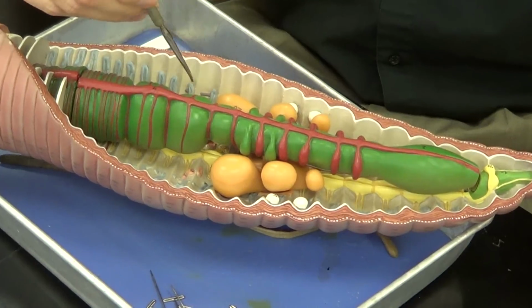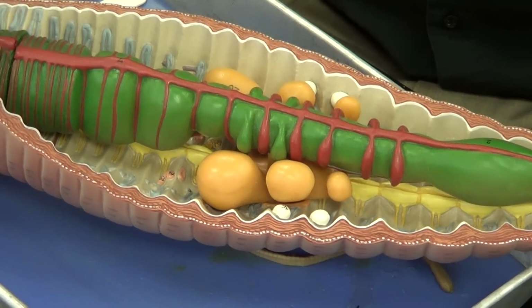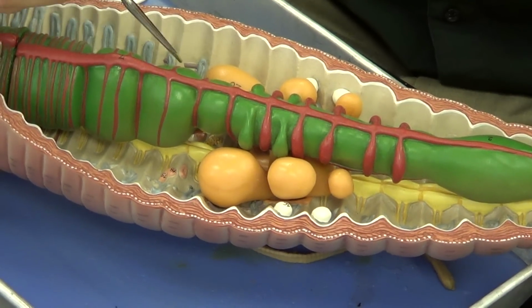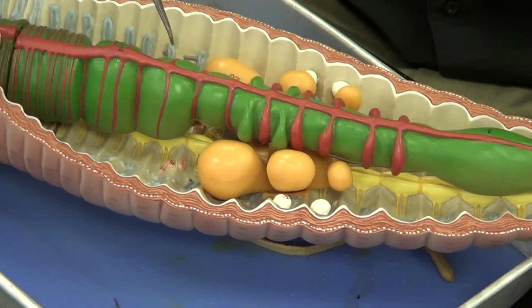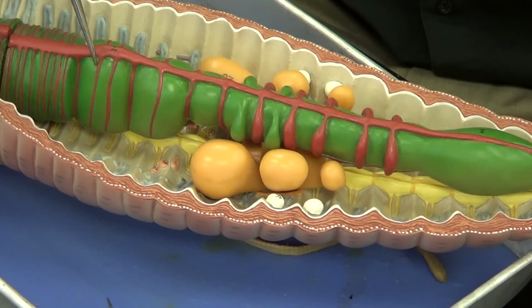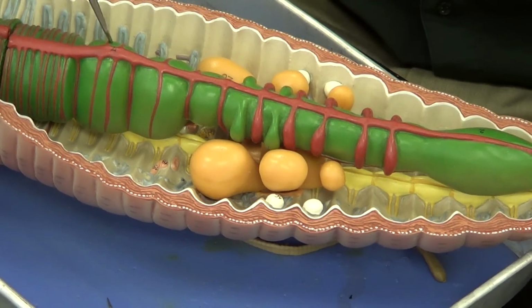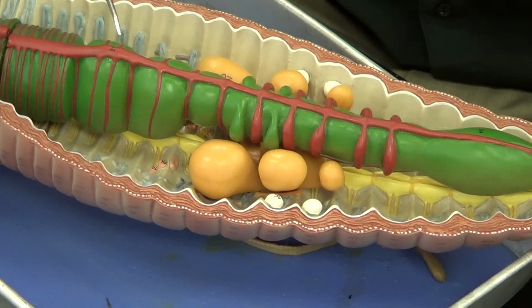the crop. The crop is a pouch, a very thin pouch, sort of like a balloon, and it's designed to increase in size because that's where the soil is going to get stored until it makes it to the next phase of digestion called the gizzard. The gizzard is a very muscular organ, so if you push on it with a probe, you'll feel the resistance of all that muscle. And it's muscular because it digests and grinds the food.